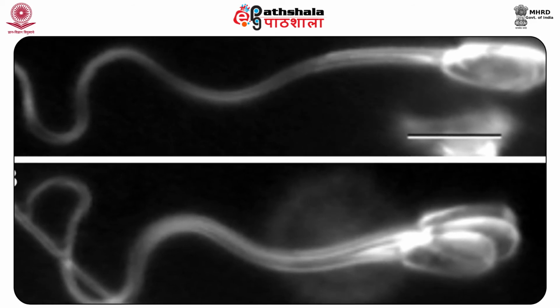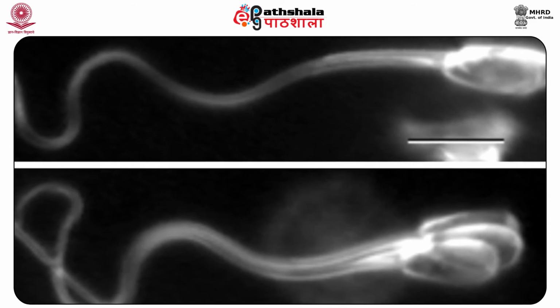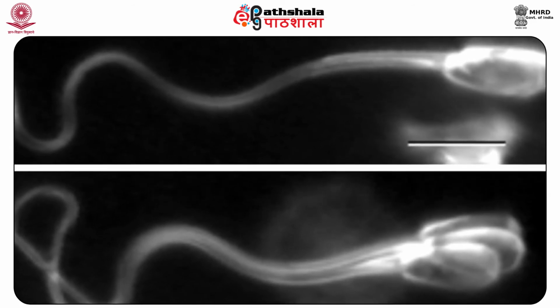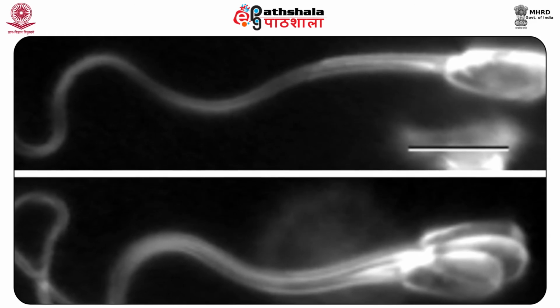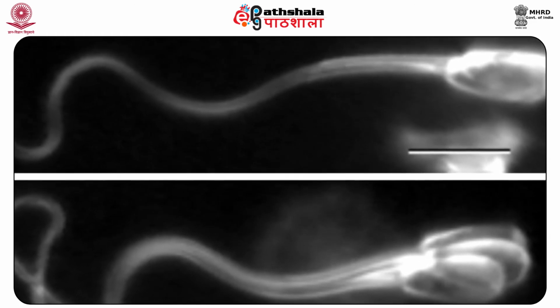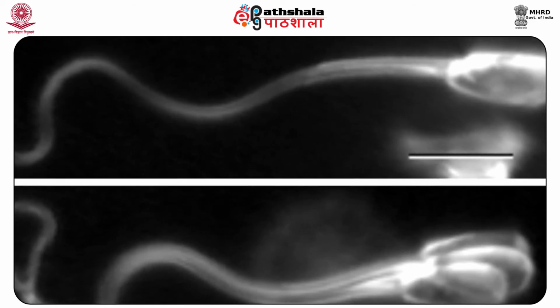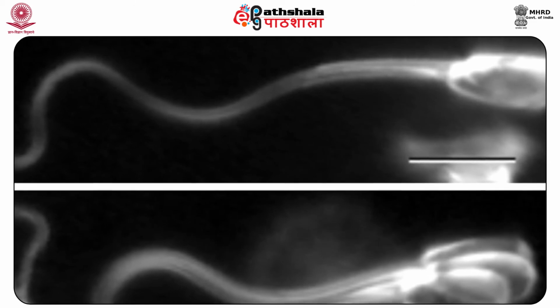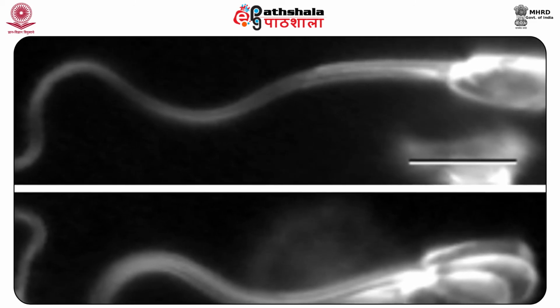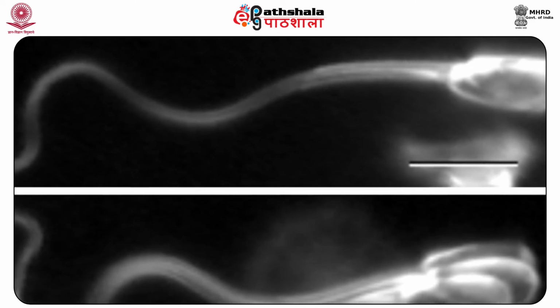It is also useful because the relative quantity of spermatozoa and epithelial cells can be assessed. This determination becomes important during subsequent DNA analysis because spermatozoa contain male DNA, while most epithelial cells in a male-female sexual assault will contain female DNA from the complainant.